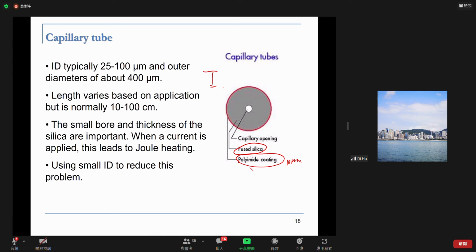So we want to put that in a temperature controlled environment, because what? Because the temperature really influences viscosity, right? The viscosity of the buffer varies with the temperature, and temperature also influences zeta potential, right? At a high temperature, that makes the Stern layer less stable, and the Joule heating must also be dissipated effectively.